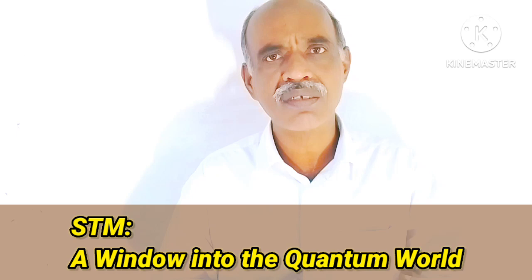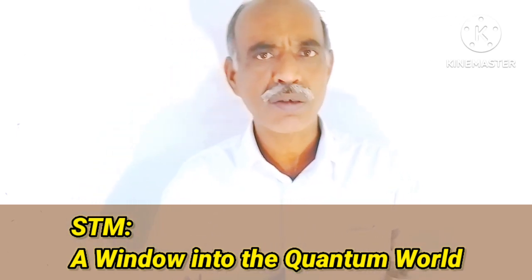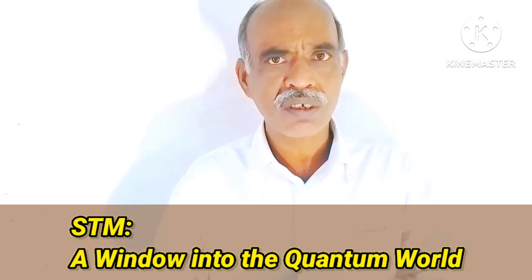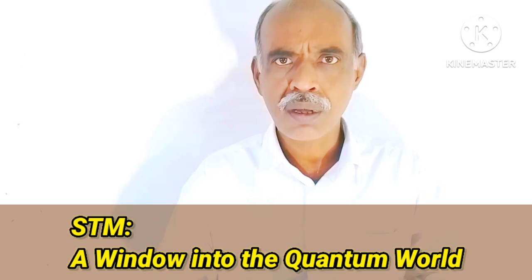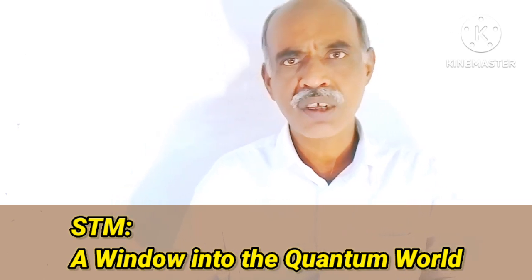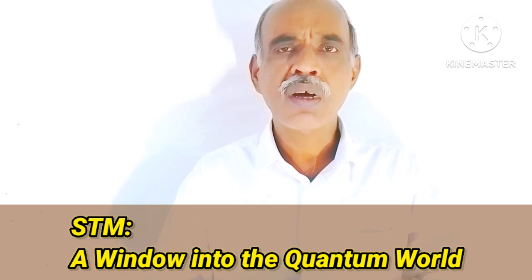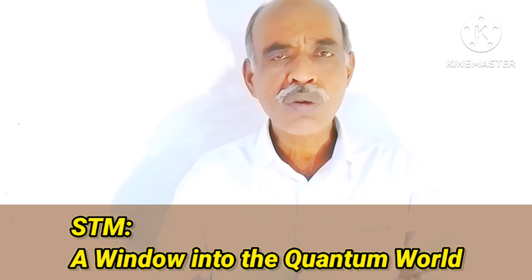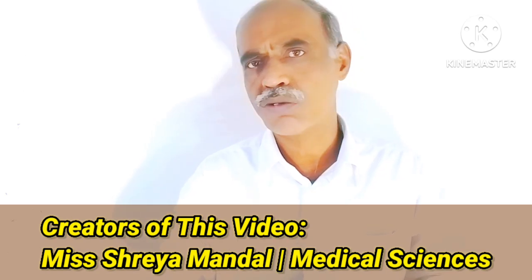In short, this is known as STM. STM means Scanning Tunneling Microscope. The process known as Scanning Tunneling Microscopy enables us to see individual atoms, and also enables us to manipulate the atoms. So the name of the microscope is the scanning tunneling microscope.